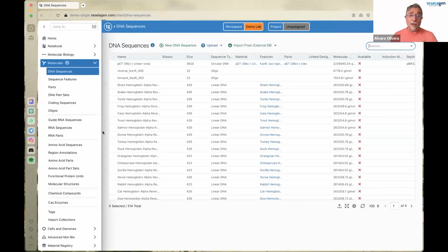All the process of selecting new parameters, for example, now is being automated and suggested for you what the modifications could be, and if you accept them, that's automated, and you don't really need to think about what parameter to modify to get good primers for your amplification. So that's one of the things that we are thinking about, and one of the enhancements for the PCR design tool. Also, the sequence alignment tools are constantly being improved.